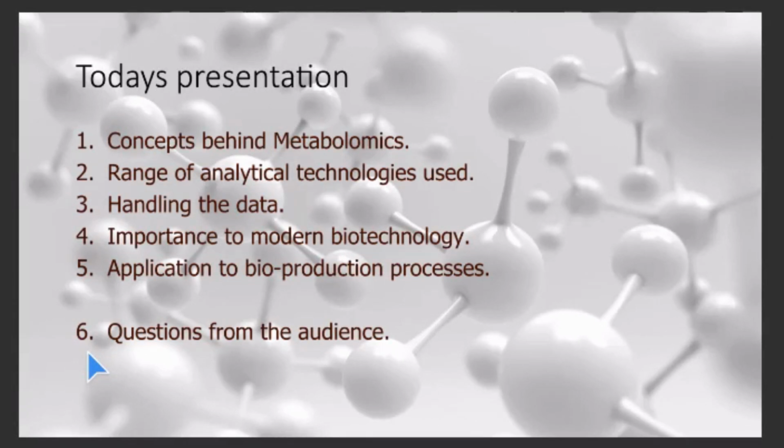I'll then be talking about how we handle the data that we get from these sorts of very large experiments. That's a very critical part of metabolomics, and it's something which definitely requires almost a lecture in itself. So again, I'll be only very briefly touching on that to give you some sort of flavour of what that is.